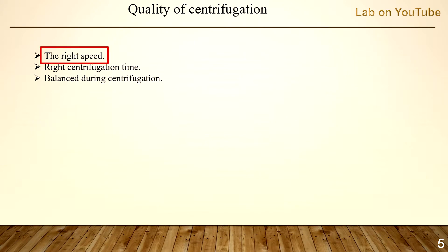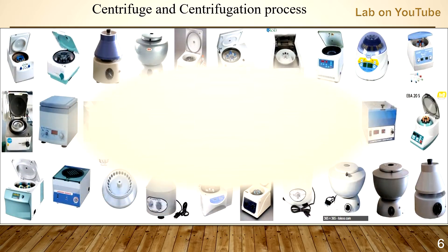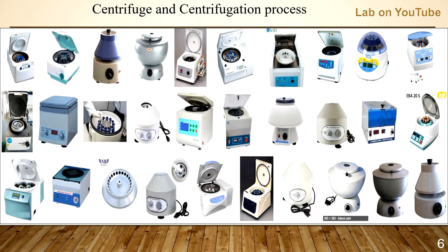Let's talk about the right speed. There are many types of centrifuges — different sizes, different motor angles, and different buckets. This variation means not all 3000 RPM readings are the same across all centrifuges.